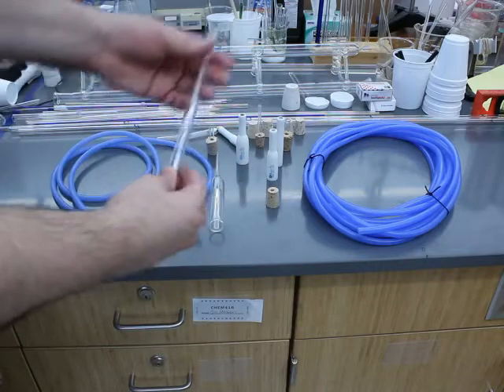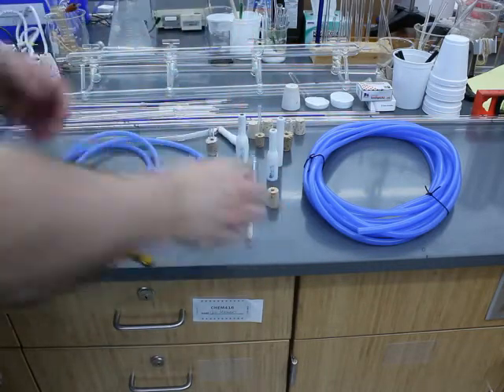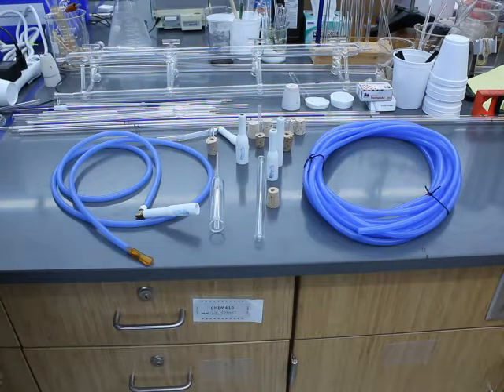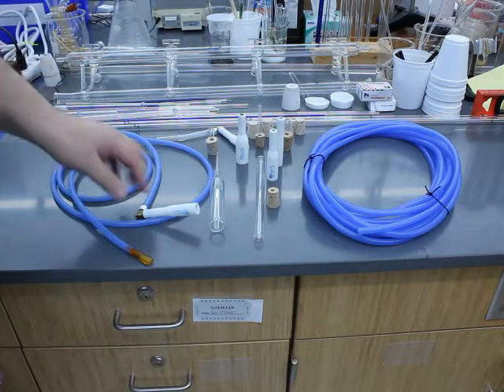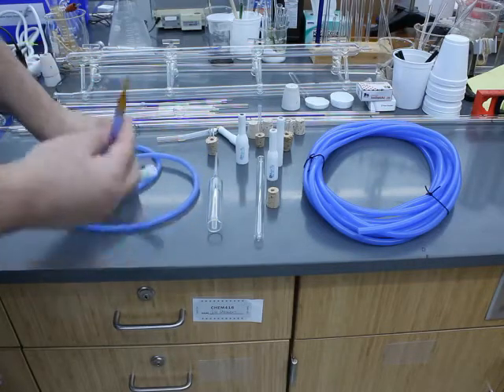Many times you can have a piece of glass heated up and blow directly into it, but that's not actually how I was taught when I learned the basics of scientific glassblowing in graduate school. The way I was taught was with a blow hose.